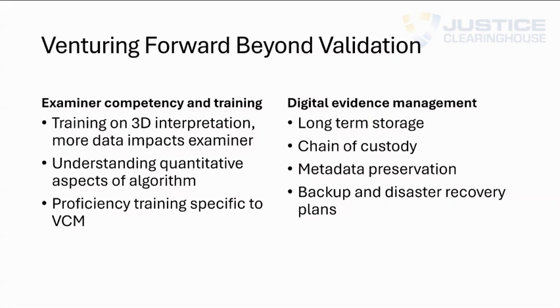And then when we're looking at digital evidence management, we have to consider such things as long-term storage. What are these going to look like? Chain of custody, metadata preservation. What are the backup and disaster recovery plans? Many laboratories have different systems into which photographs have generally been imported. How are these going to be managed as we move into virtual comparison microscopy? Because the different systems have different ways of documenting certain things.